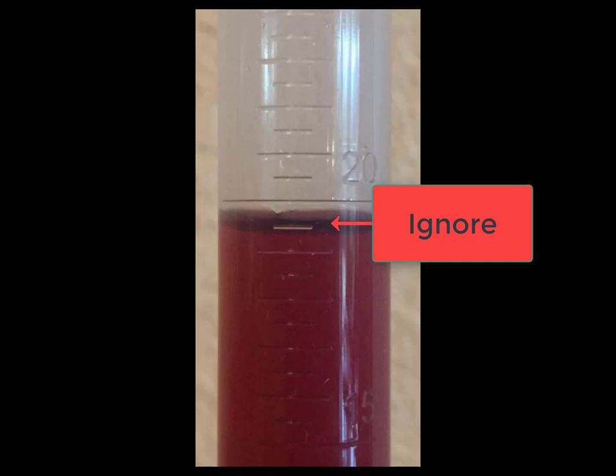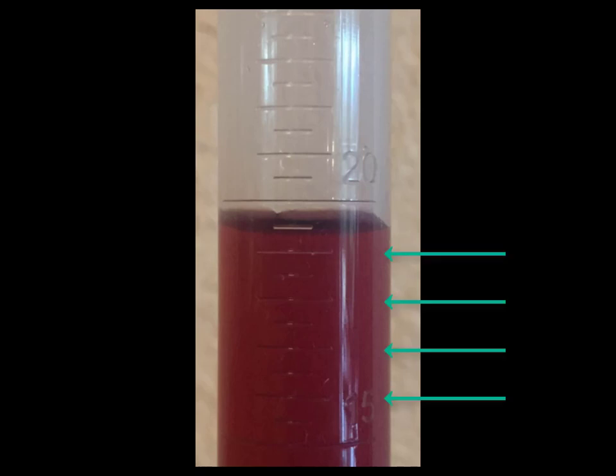What I want you to do when working with this graduated cylinder is to ignore that smaller graduation. Therefore, let's count from 15 to 20 and use the larger graduations between the 15 and the 20. Doing that, we're incrementing or affecting the ones place as we count from 15 to 20.